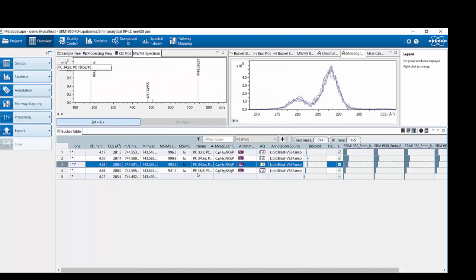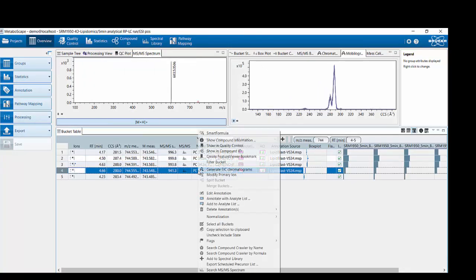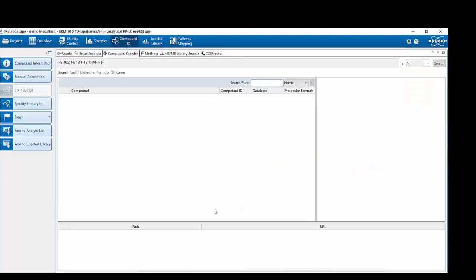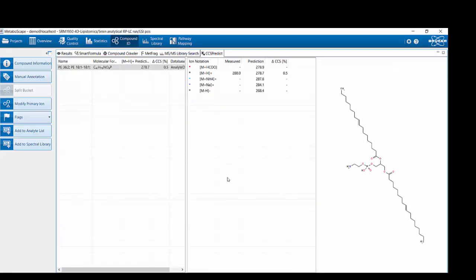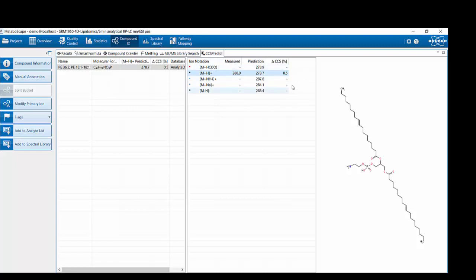For the second example, the PE: searching by name gives a hit for PE 36:2. Performing the CCS prediction for the M+H found, we get a deviation of measured versus predicted CCS value of only 0.5 percent.